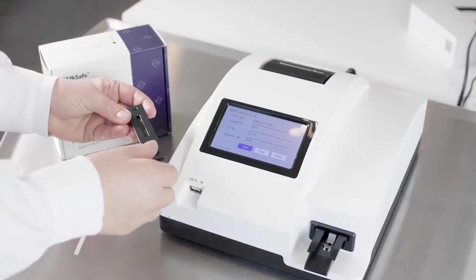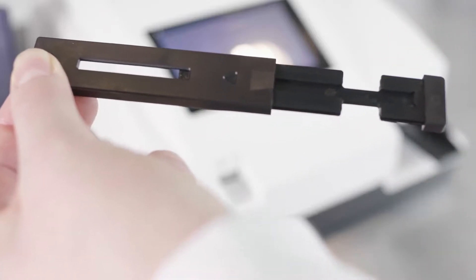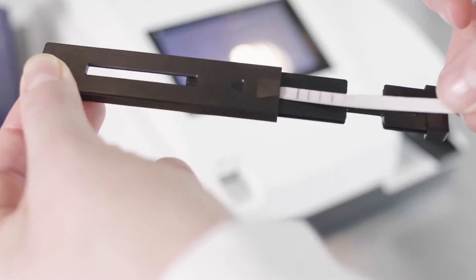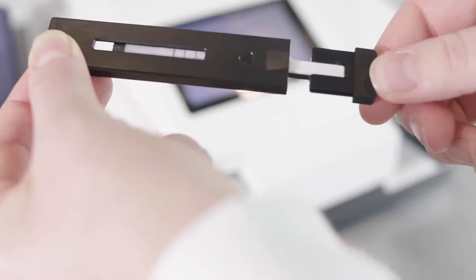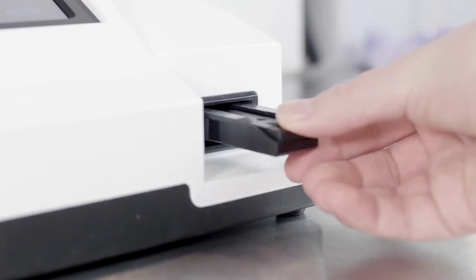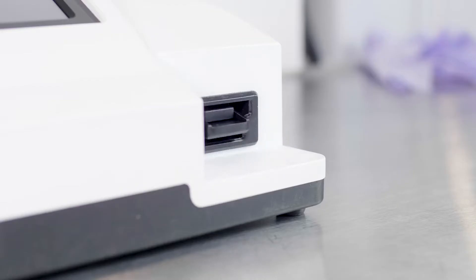Insert the test strip into the cartridge. Insert the cartridge into the port on the reader. Press Test to initiate the analysis of the result.